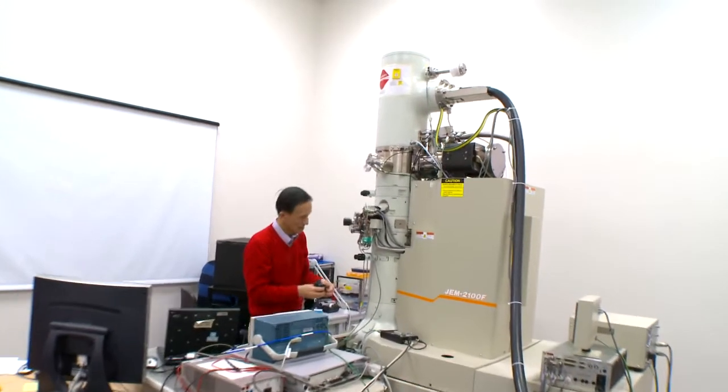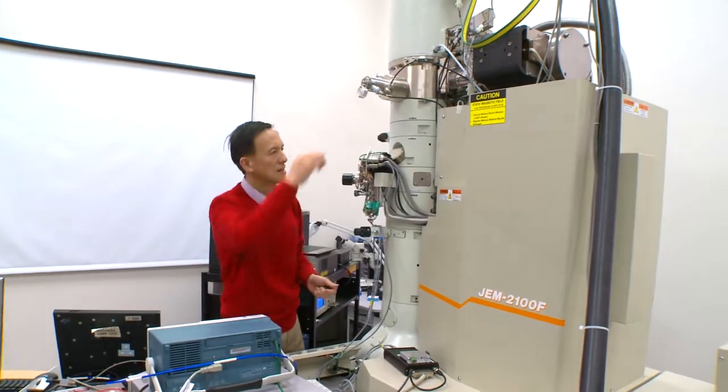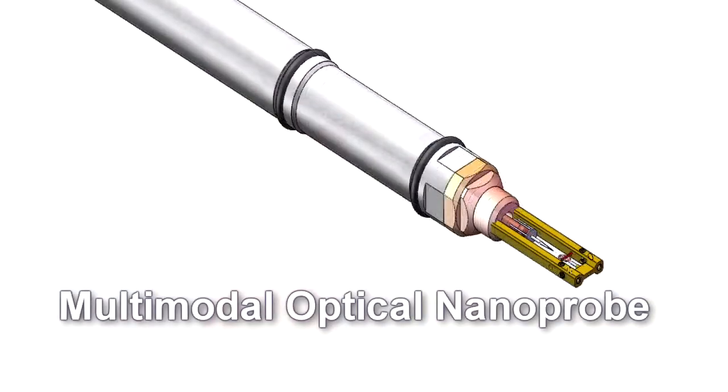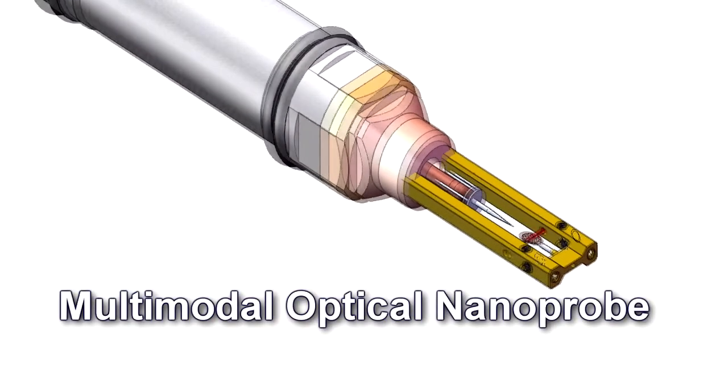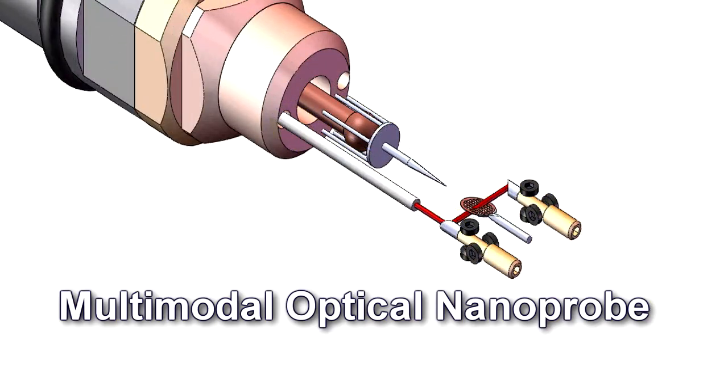Scientists working in Brookhaven National Laboratory's Department of Condensed Matter Physics and Material Science have developed a new transmission electron microscope sample stage that allows researchers to examine nanoscale samples and features in ways never before possible.